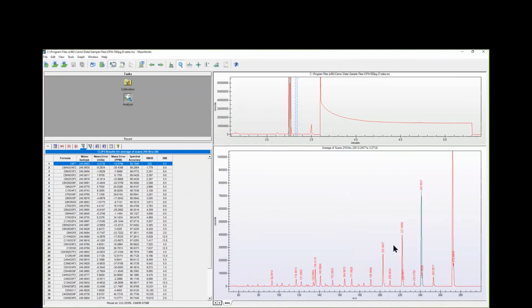Okay, and this is exactly what you would do on a high resolution instrument, except you might not have a high resolution instrument or it's on your wish list. If you had a high resolution instrument, you're always going to do better because you have better signal to noise, because the TOF instruments, for example, are more sensitive, and you would have better resolution, which means that it's less susceptible to underlying interferences. And if you get really complex matrices, the weakness of lower resolution is that you can't see the underlying interferences.